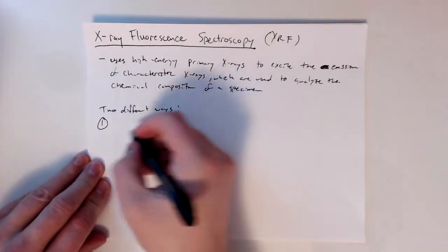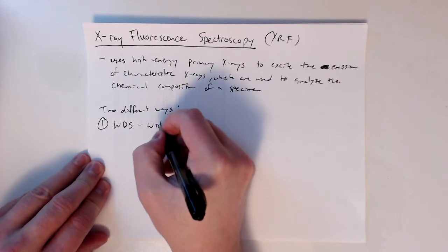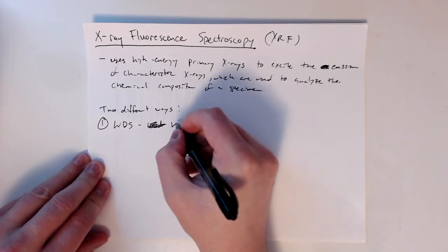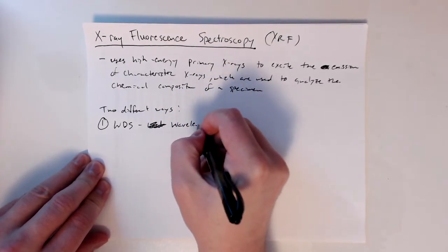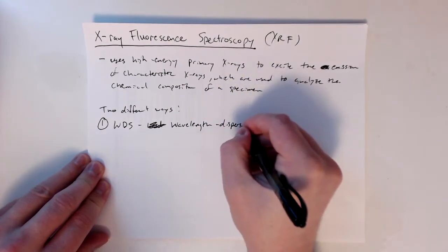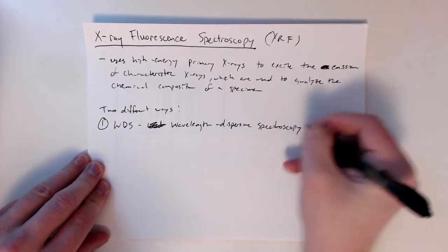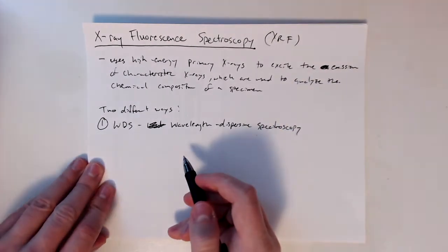So the first one is known as WDS, or sorry about that, that should be wavelength dispersive spectroscopy. So that's WDS.